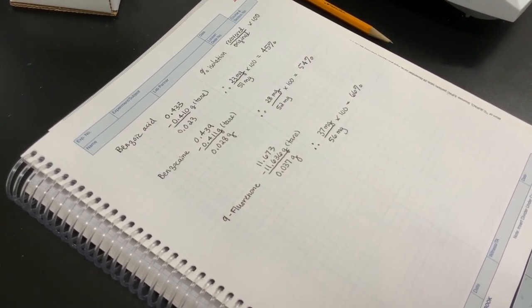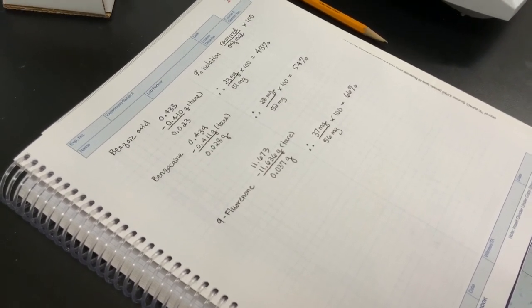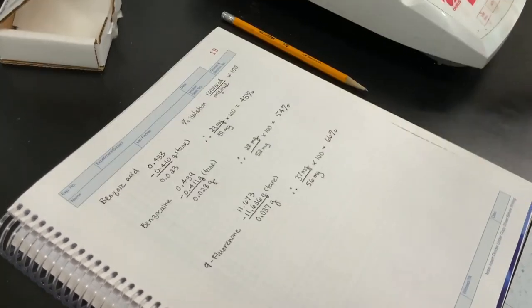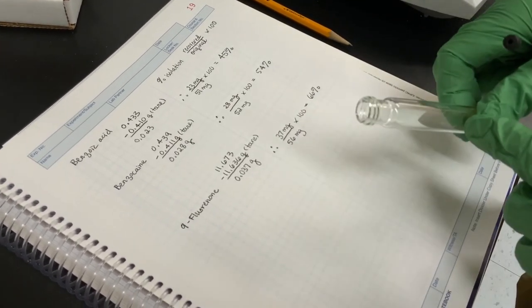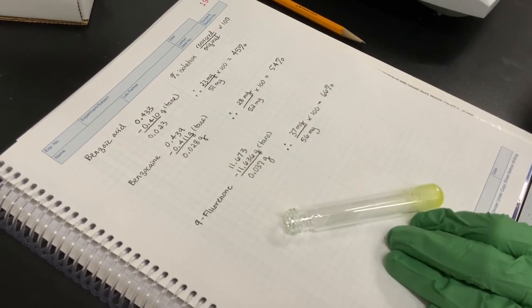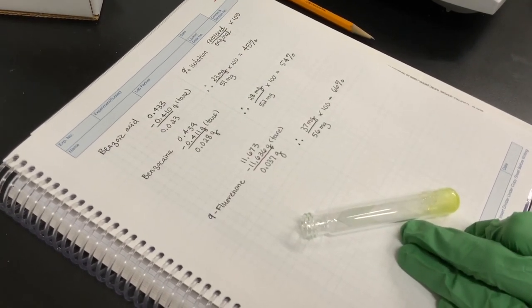We can certainly say that due to the fact that when we were boiling off the methylene chloride in this culture tube, right, we had accidentally superheated it, and some of the solution bumped and flew out, right? It bumped out of the culture tube, and so it carried with it some of the 9-fluorenone. So we lost some of the material that way.